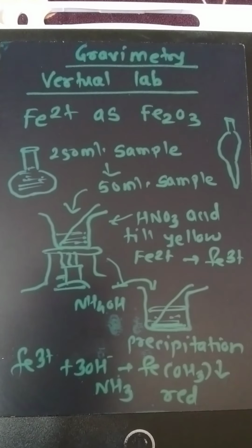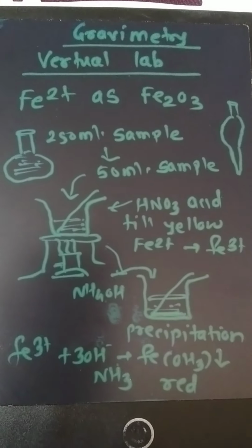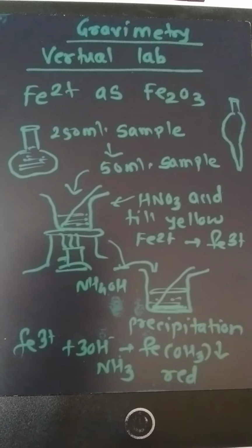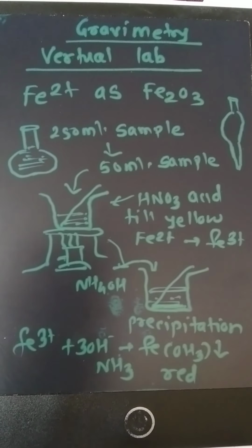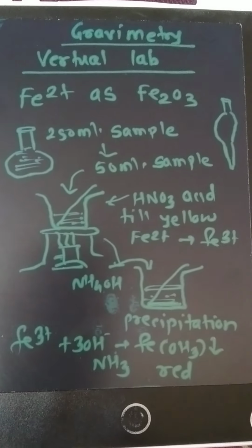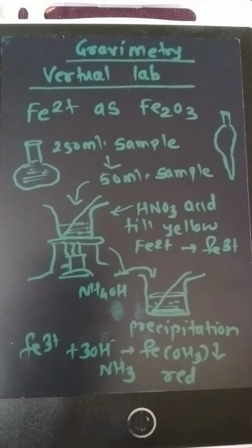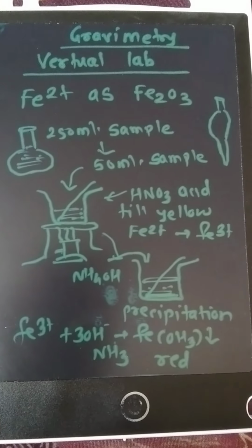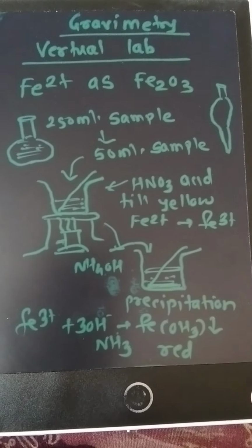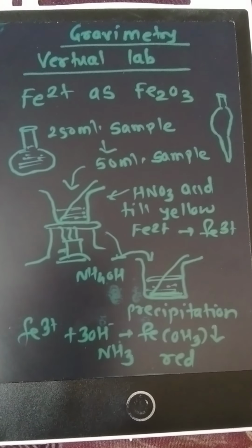Hello students, today we'll learn one of the very important concepts about practicals, as laboratories are closed. So in this period, the virtual lab concept is very important and is getting more attention and importance to study the chemistry laboratory by use of the boards. That is why virtual mode. Today we'll learn one of the experiments, that is gravimetric analysis by virtual lab technique.